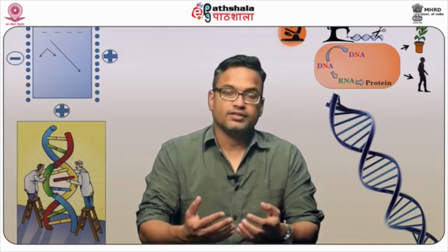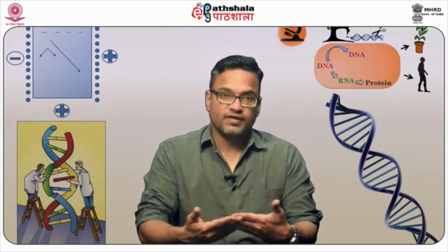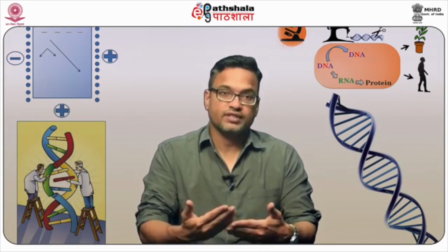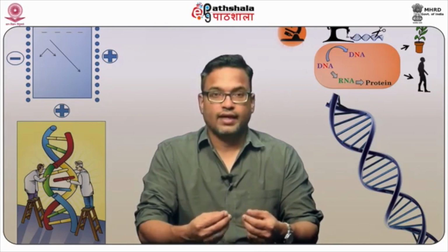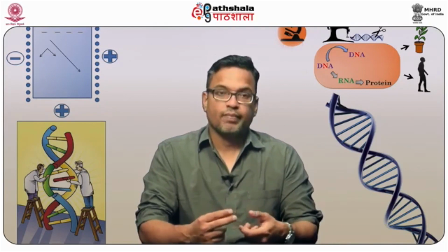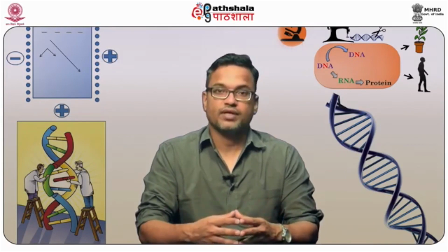resolution image. Two photon, on the other hand, is a technique which allows much more specific as well as higher resolution, because in this the fluorophore is excited with two photons, and in combination they produce a better resolution compared to confocal and wide field microscopy.